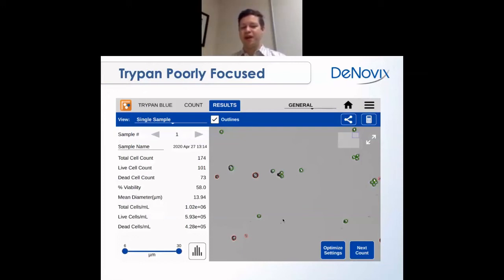So you went from 90 to about 60%, and your live cells per mil went from around 900,000 to about 600,000. So you're going to have a very different calculation and a very different amount of cells that you're going to be adding into your experiment based on how you focused this.